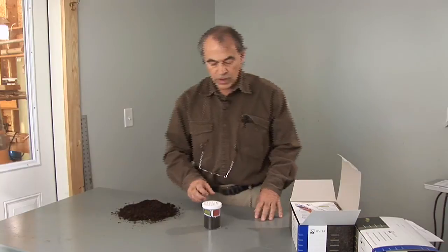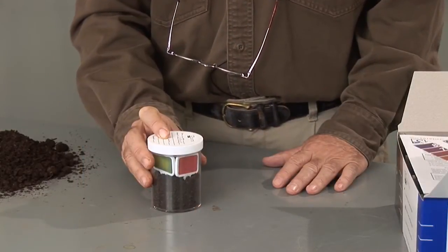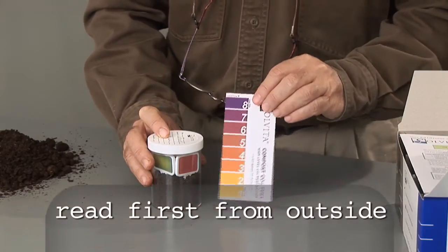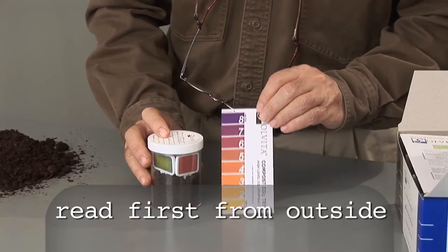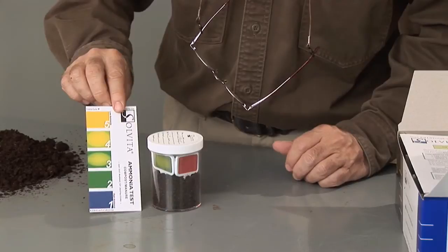I'm back after four hours and we're going to determine the results of the compost test. We can open the jar to take the reading, but first notice, looking through the outside of the jar, how the colors have changed for both the carbon dioxide test and the ammonia test.